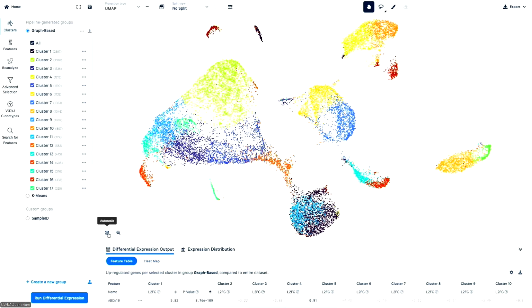And so this is the single cell data. It's about 17,000 cells generated from an FFPE block. And so we took a couple of scrolls, dissociated the tissue, got nuclei, and profiled nuclei with Flex. And this is what we got.